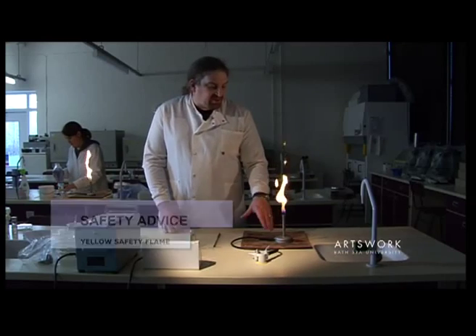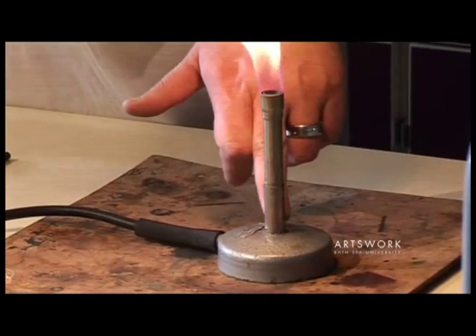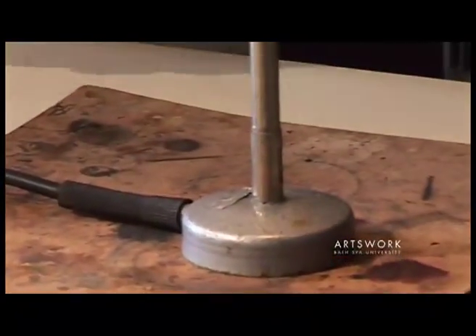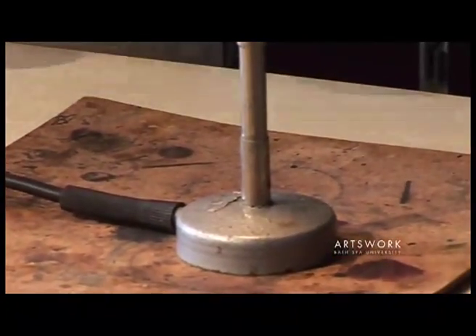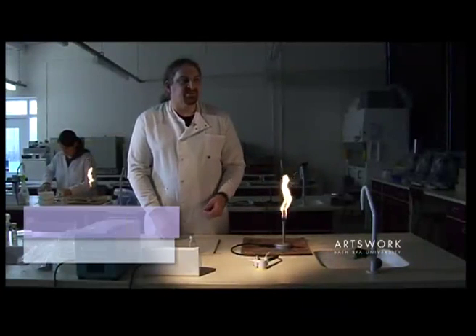We control the flame by using the revolving metal collar at the base of the Bunsen burner. When it's revolved so the air hole is blocked, the lower rate of airflow produces this much cooler yellow visible flame.